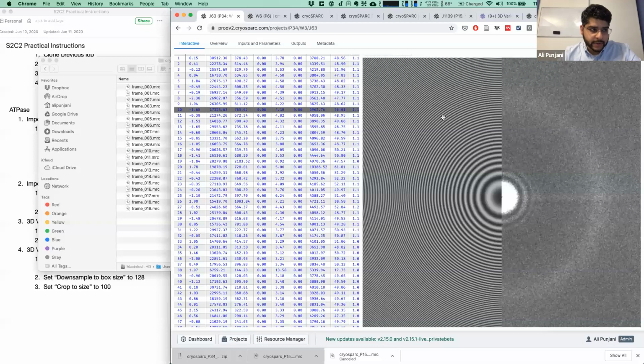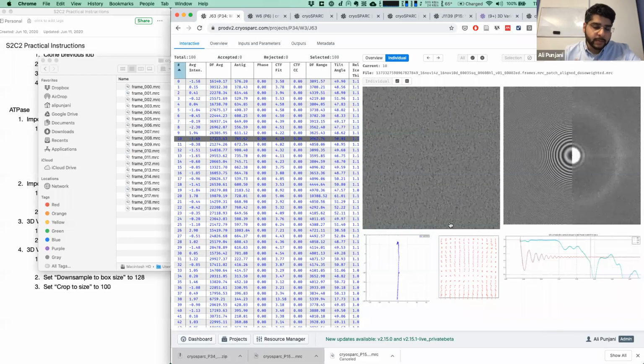What we're looking at in this picture of the Fourier transform is, on the right-hand side, the experimental Fourier transform of this image. Normally, if you study Fourier transforms, you will see that when you take a Fourier transform of a 2D image, you get a square 2D Fourier transform that has circles that go all the way around. That is true, but a Fourier transform of a real space object is actually redundant, in the sense that its left and right half, or top and bottom half, or whichever way you cut it in half, are identical, just mirror symmetric. So we don't need to see the whole thing, we only need to see half of it. And so the right half is exactly the Fourier transform of this raw image.